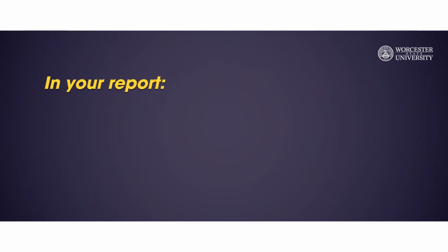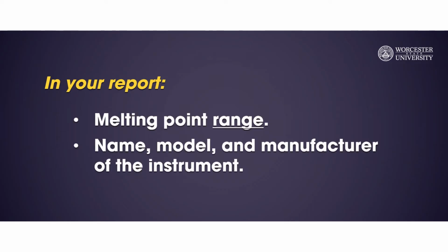Reminder: in your report, you must always report the melting point as a range, along with the information of the instrument you used, which includes the name, model number, and the manufacturer.